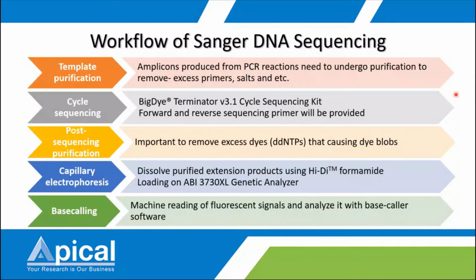After determining the pure template, we will quantify it, and then we'll know how much DNA template should be used in the sequencing cycle.